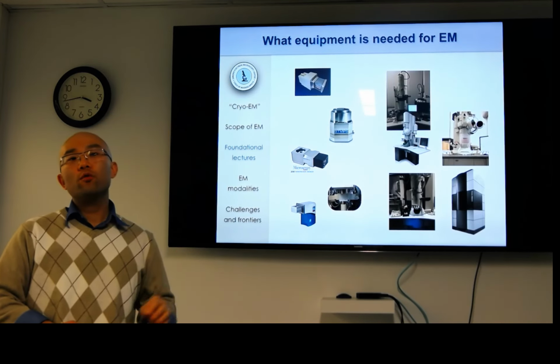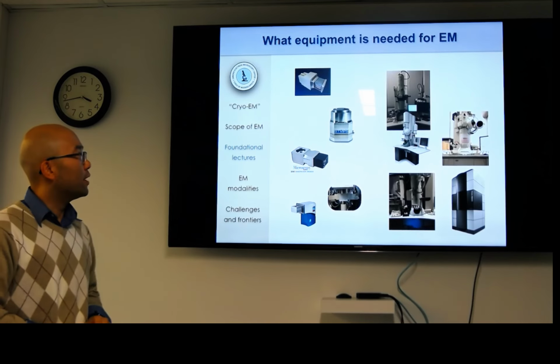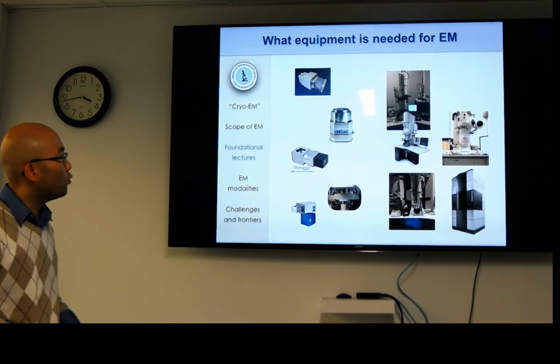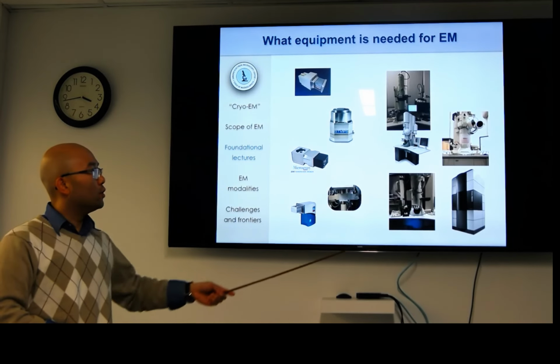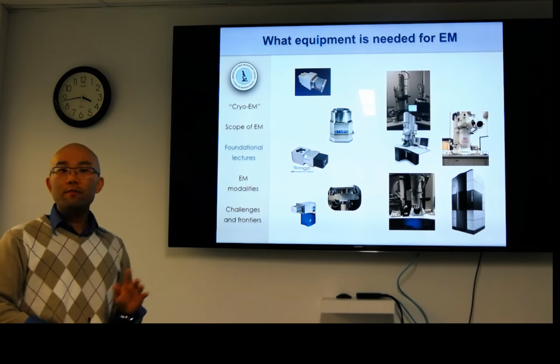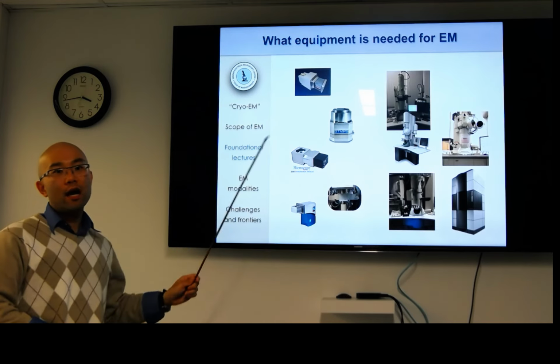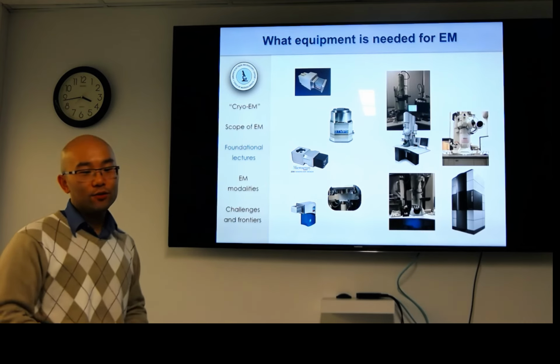But microscopes are one thing. There's been a resolution revolution, as it were. You might hear that term used quite often, and that's because our detectors have gotten more and more sensitive. So we can take a 10-year-old microscope, where we might have been in the sub-nanometer range, and now we can go to near atomic range, and that's by just getting a better camera on it, so to speak.